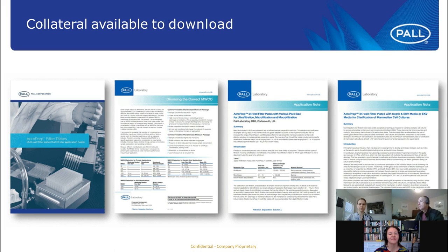All right, great, thank you. Next question: which plate has better binding capacity in 96 well and 384 well plates for DNA and RNA? Okay, so again, it usually depends on your application and starting material. I do know we have some application notes that talk about the performance based on sample type, as well as the nucleic acid desired. Jorgen, would you have a better answer to that? I think it really just depends on the sample type in terms of which one would be better.